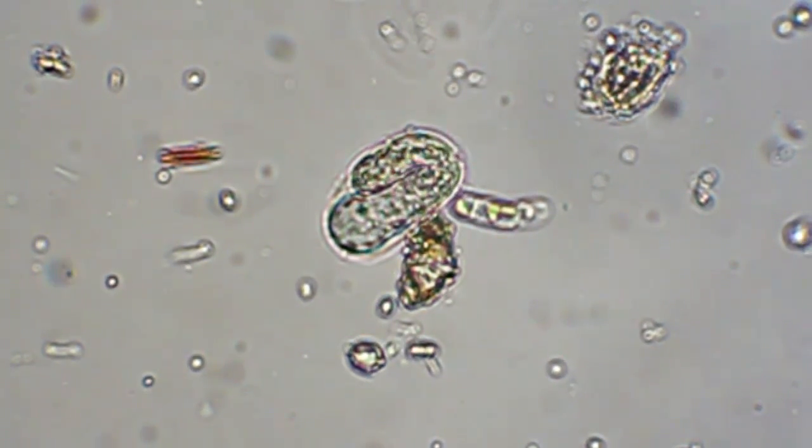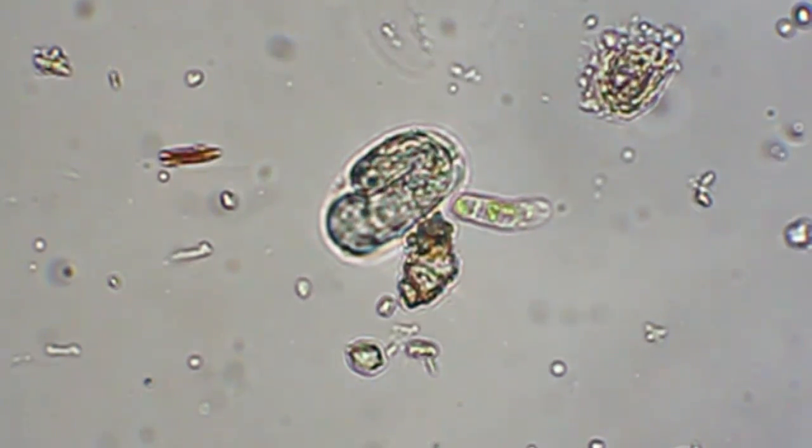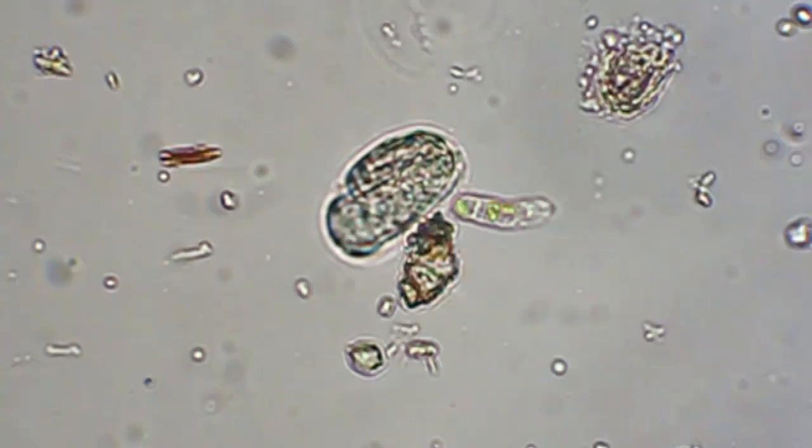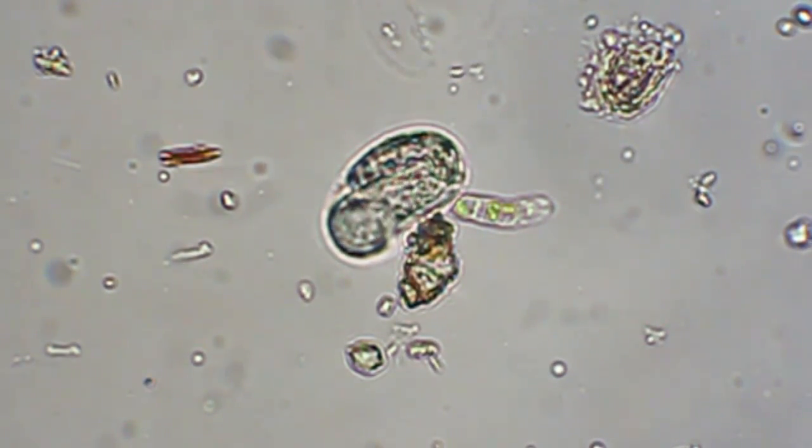I have no idea what this thing is — looks like some kind of egg. There's something moving inside of it.